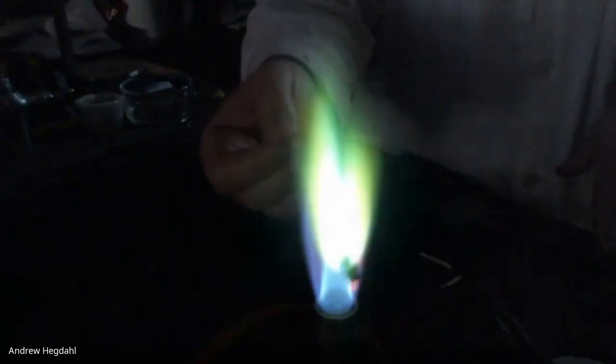So each of these is going to give off its own unique colored light. And that's what's going to go in the next column where it's the flame description, okay? If you leave this in here long enough, then the water is all turned to steam, and you start burning the wood, and you'll get the yellow color, okay?